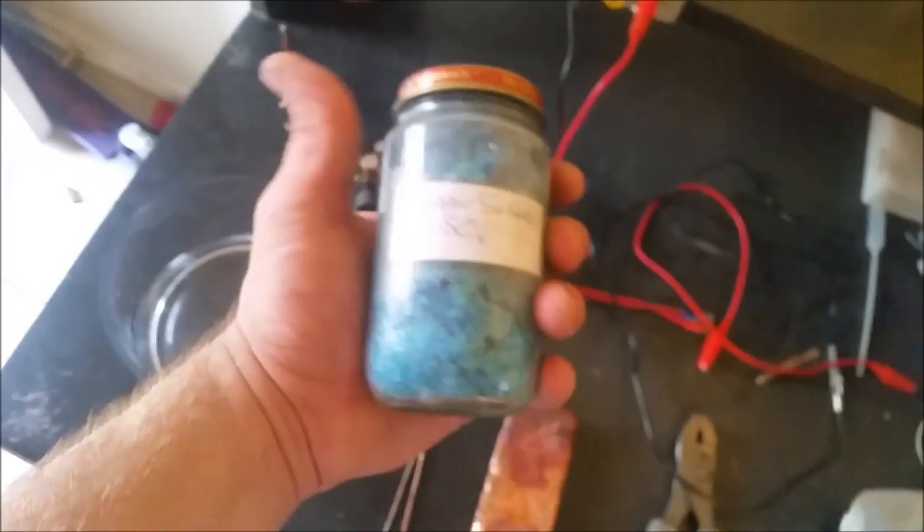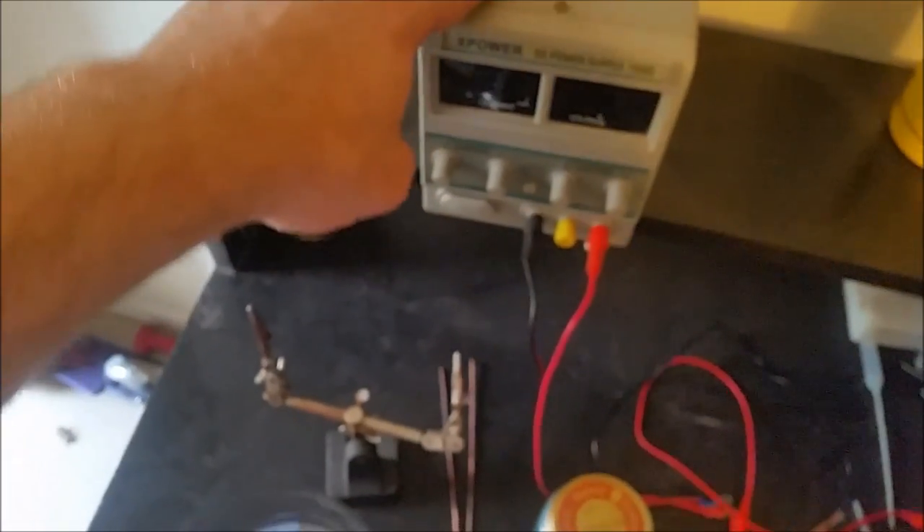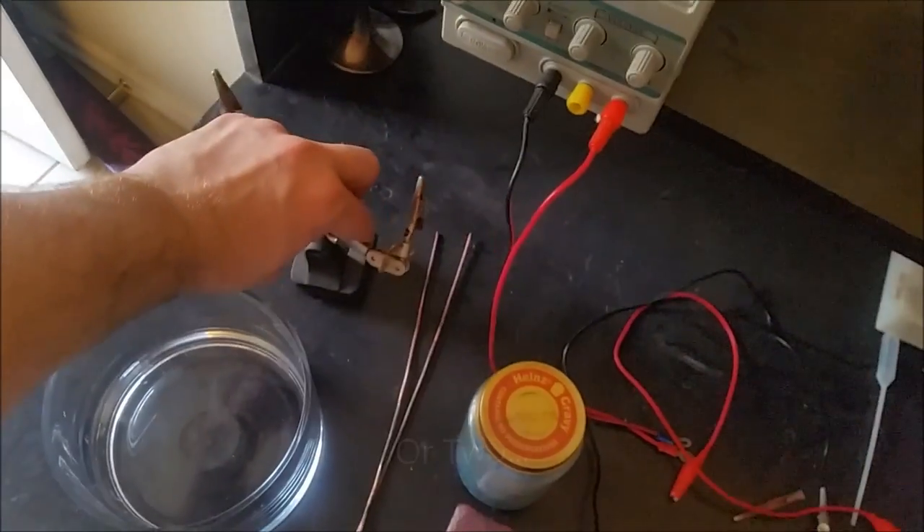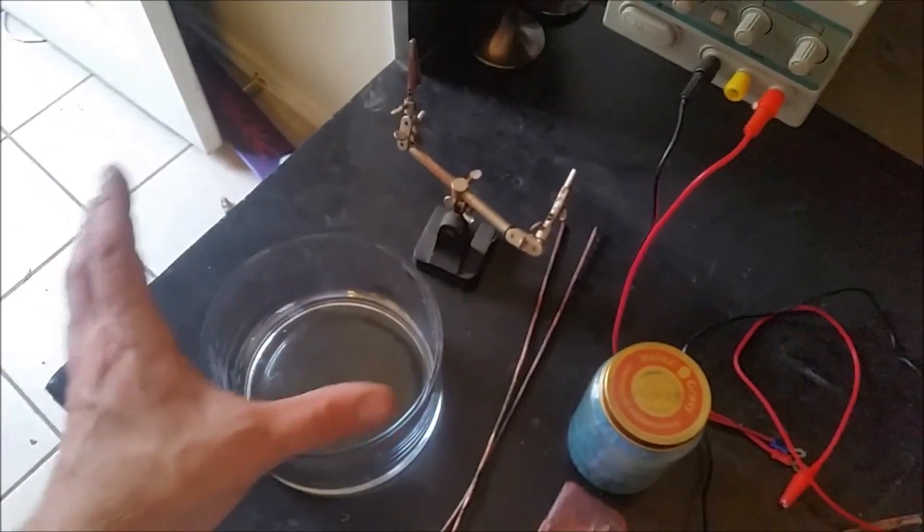The solution I use is copper sulfate — I just mix it in with some water, and that is it. I use a cheap benchtop power supply. I don't really feed a whole lot of power to it at all. In fact, this is a really slow process — this takes about a month. I've got these little helping hands here to help hold the wires and everything together.